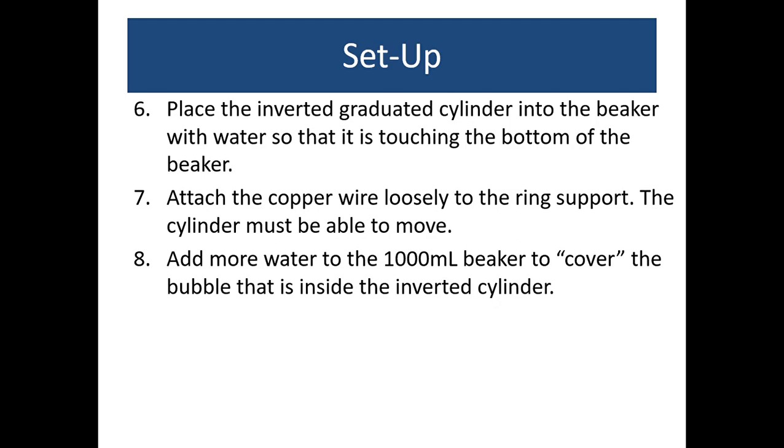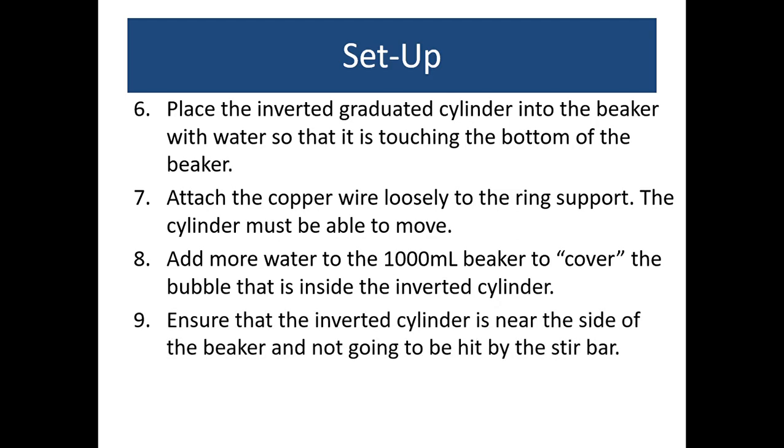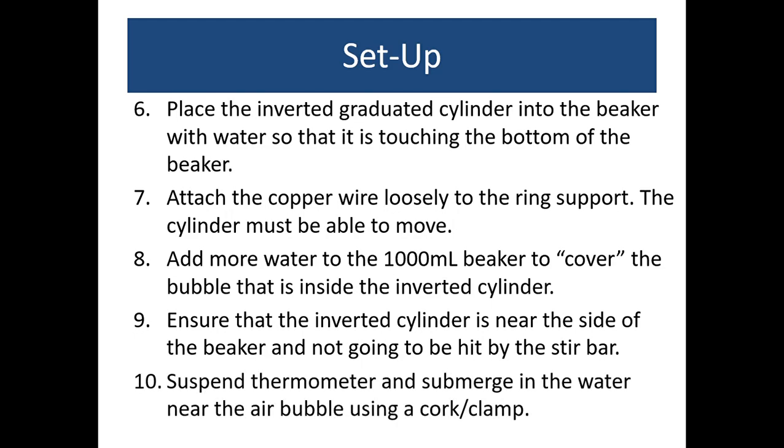You want for that bubble to be essentially surrounded by the water on the outside of the graduate cylinder. Make sure the inverted cylinder is near the side of the beaker so that when you start stirring the stir bar it will not hit your graduate cylinder. Now you'll attach the thermometer which will be suspended, submerged in the water while being held from a cork clamp and onto a ring stand. Try to make sure the thermometer bulb is near where the air bubble in the graduate cylinder is resting.